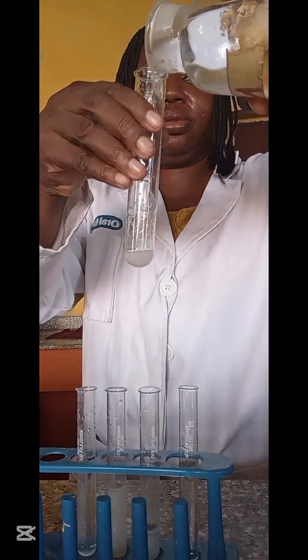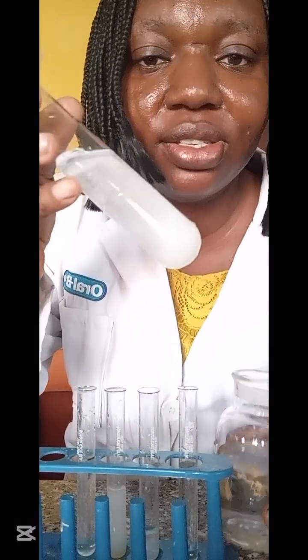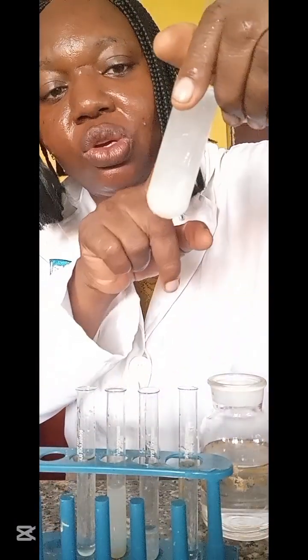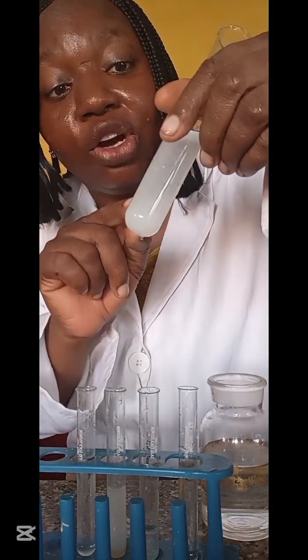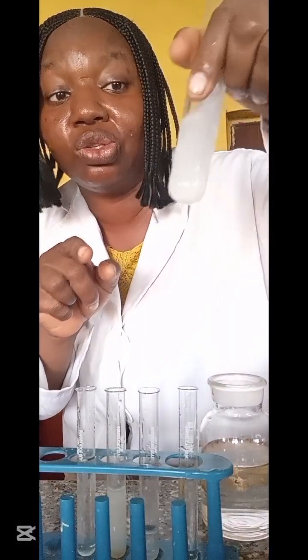With ammonia, in drops, gelatinous. In excess, you see, it became more cloudy. It did not dissolve no matter how much you shake. Instead of clearing up, it will become thick and settle. That's how to know that something does not dissolve. So this is aluminium. It does not dissolve in ammonia, but zinc does.